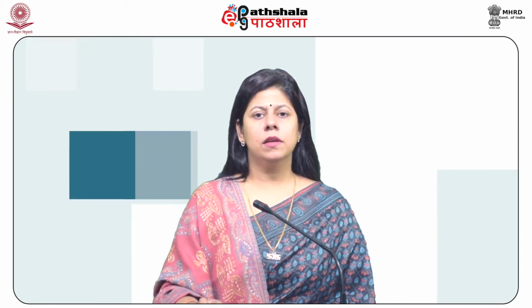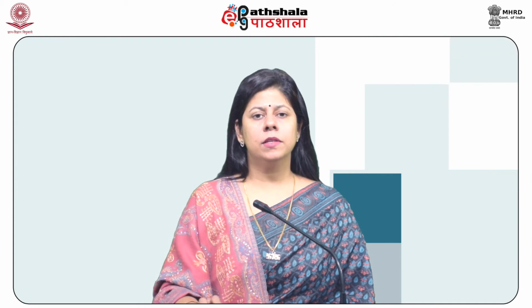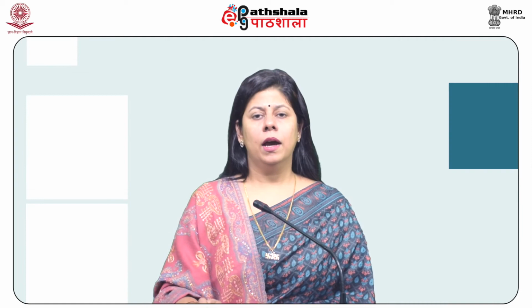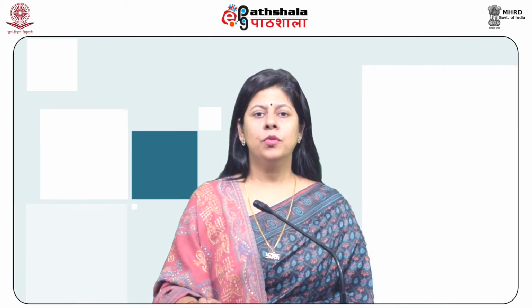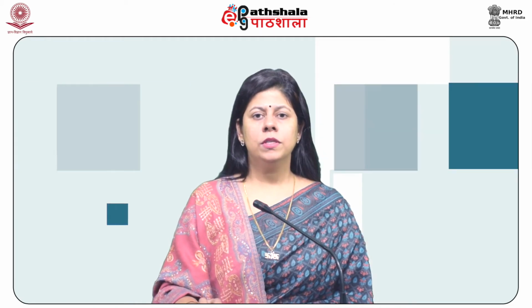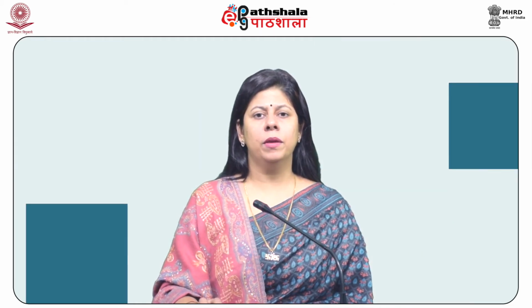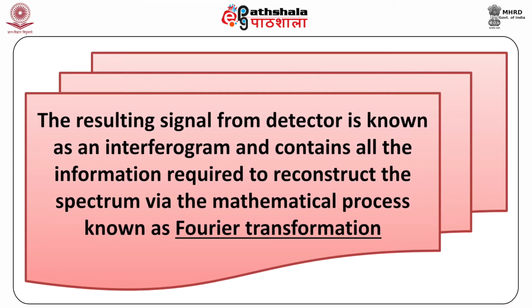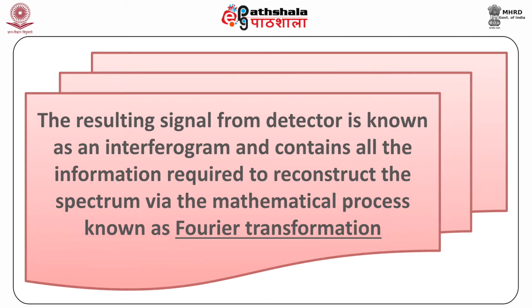This detector signal is sampled at precise intervals during the mirror scan. Both the sampling rate and the mirror velocity are controlled by a reference signal incident upon a detector, which is produced by modulation of the beam from the helium neon laser. The resulting signal from the detector is known as an interferogram and contains all the information required to reconstruct the spectrum via a mathematical process known as Fourier transformation.